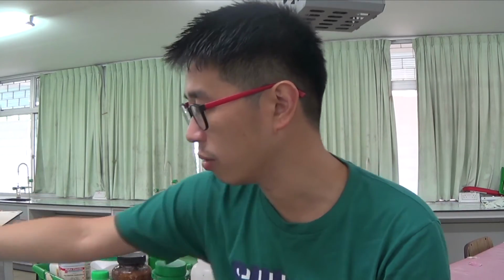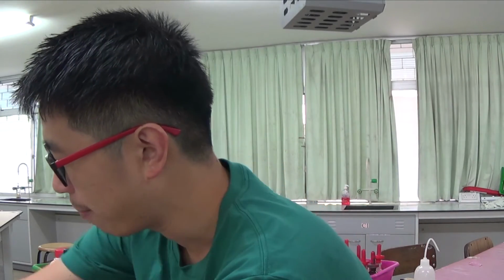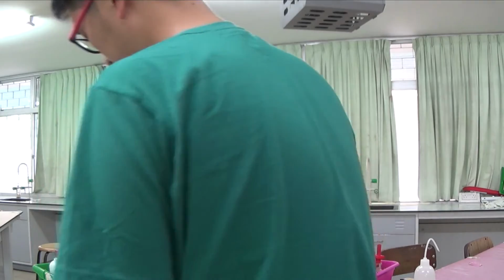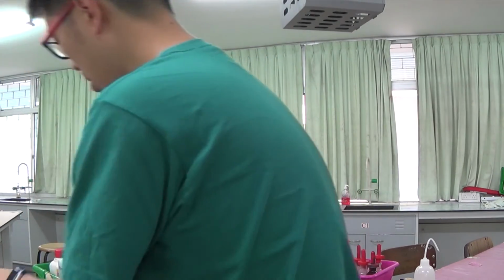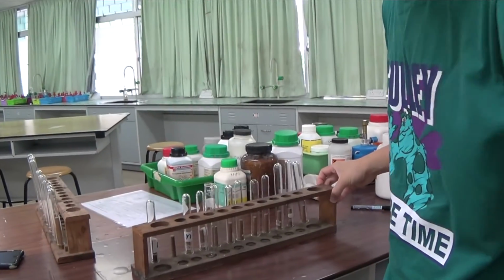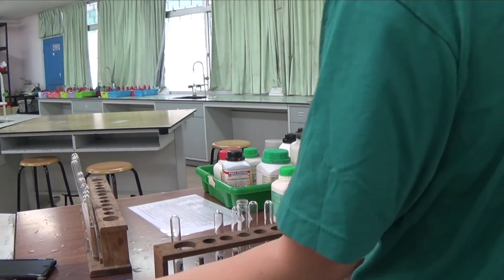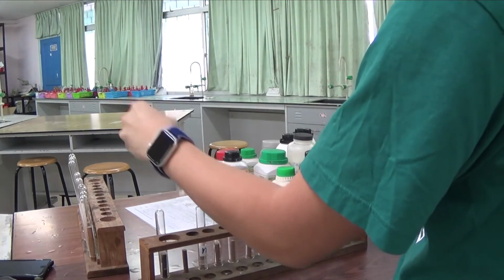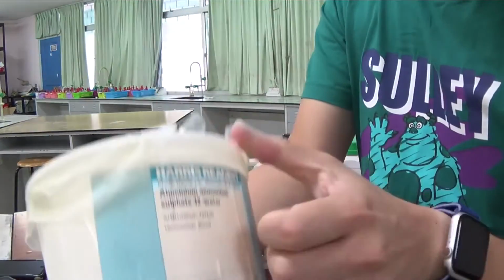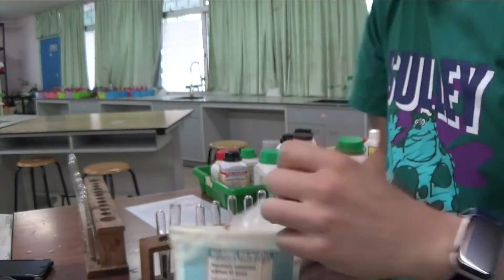Okay, so time to get started on the experimental procedures, which is what I really want to convey for these particular tutorials. Let me get started. I want to move my iPad away from all this fire and stuff. Okay, so we have an array of test tubes here. So let's focus on my face and more focus on the practical itself. What do I have? Okay, so I should take out some solid. Let me start out with something simple, which is aluminium ammonium sulfate.